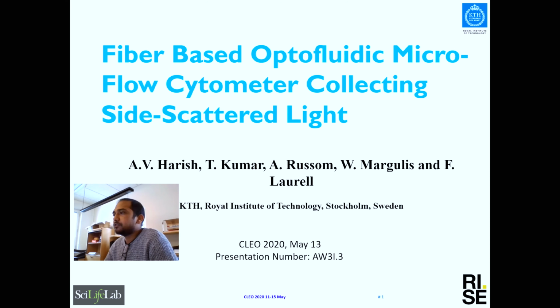Hi, I am Harish from KTH Royal Institute of Technology, Stockholm, Sweden. I'm giving my talk on a fiber-based optofluidic microflow cytometer collecting side scatter light.